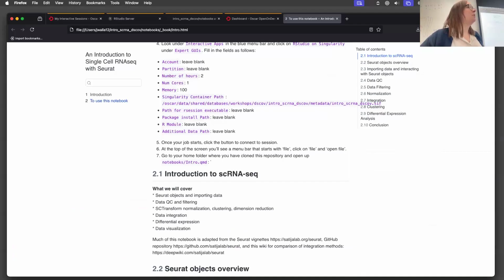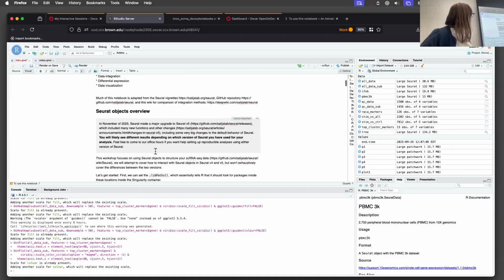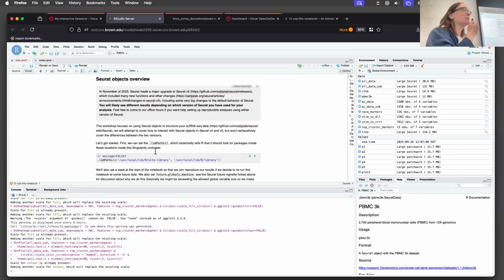What was the issue, Eric? I'm not actually sure, the R stuff. It just started. Singularity session just crashed. Oh, okay. When did you open that? So go to wherever you are. Intro. And then you just say.